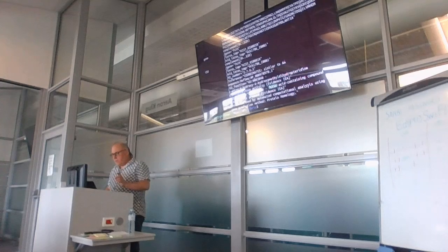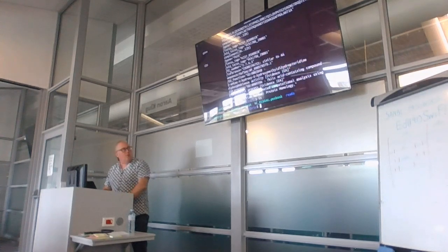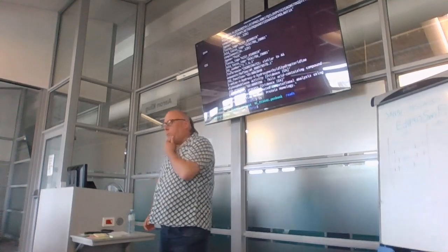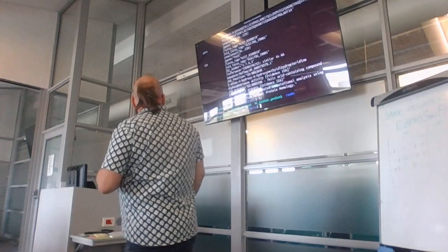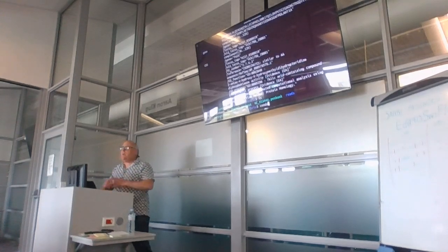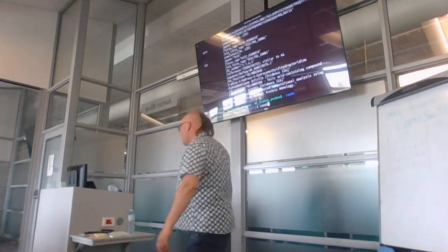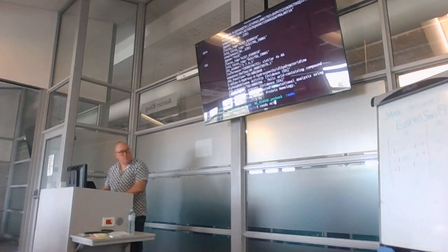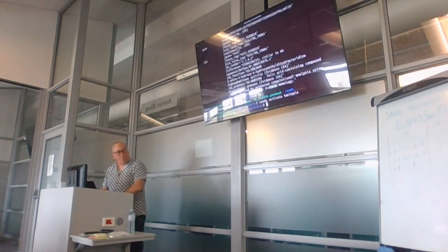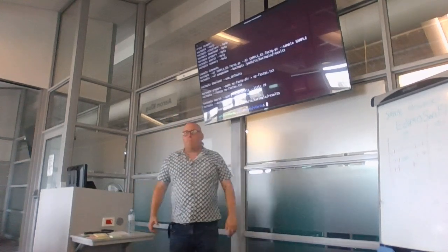Now, it's time to get to play with dangerous things, okay? Which is the actual code of these things. First thing that we need to do, we need to prepare our Bactopia to be ready to be used, okay? I don't think it's going to affect us so much, but let's just run. We've now all got a Bactopia Conda environment. So how do I activate a Conda environment? conda activate, the name of the environment, okay? And if I just run Bactopia, then it tells me it can do various things. That's the Bactopia command.